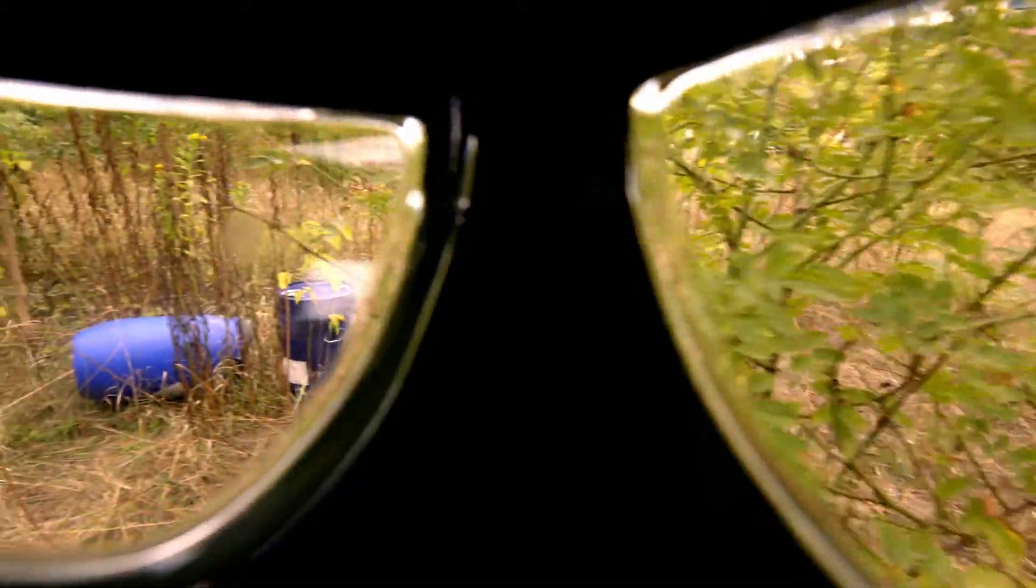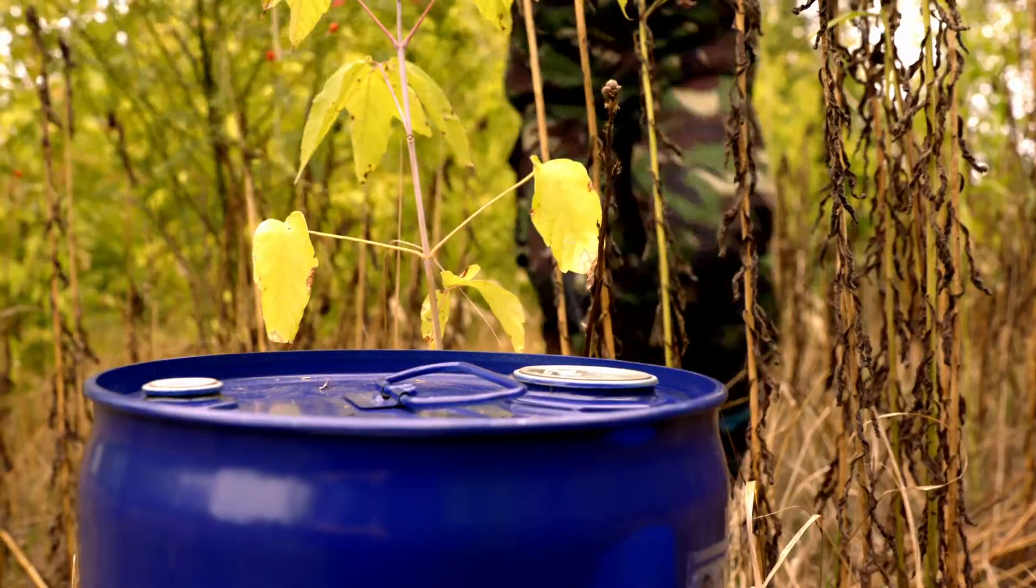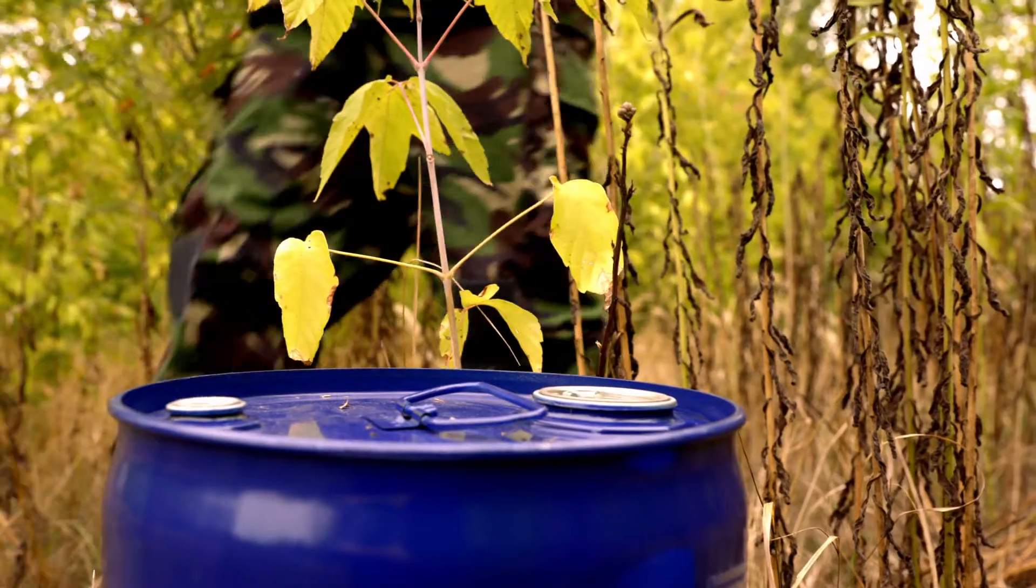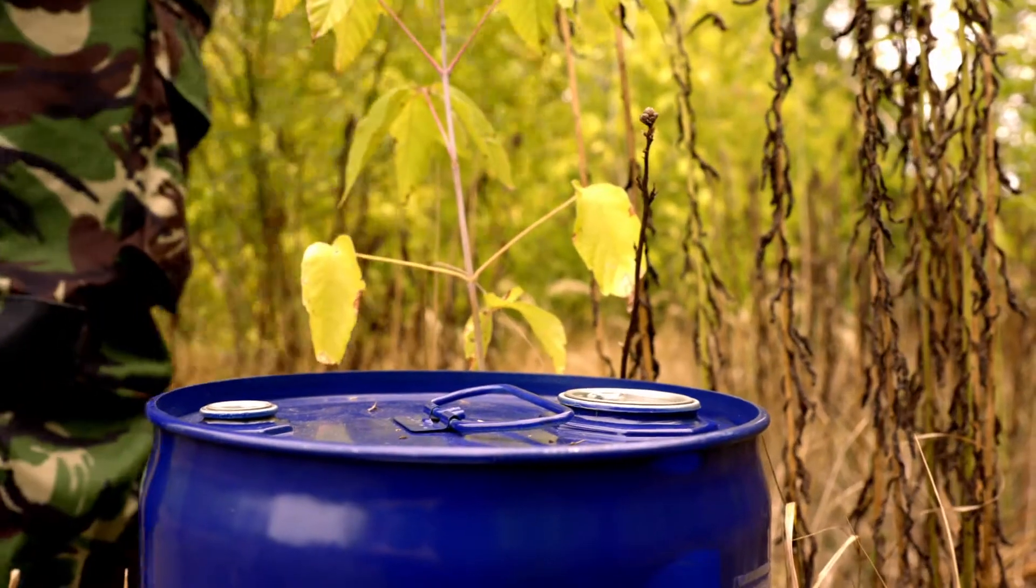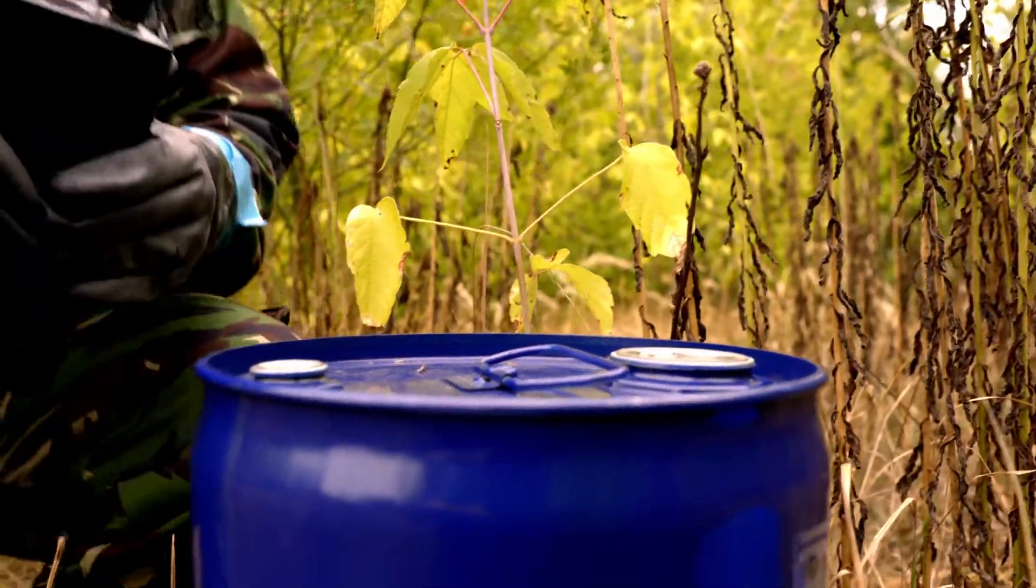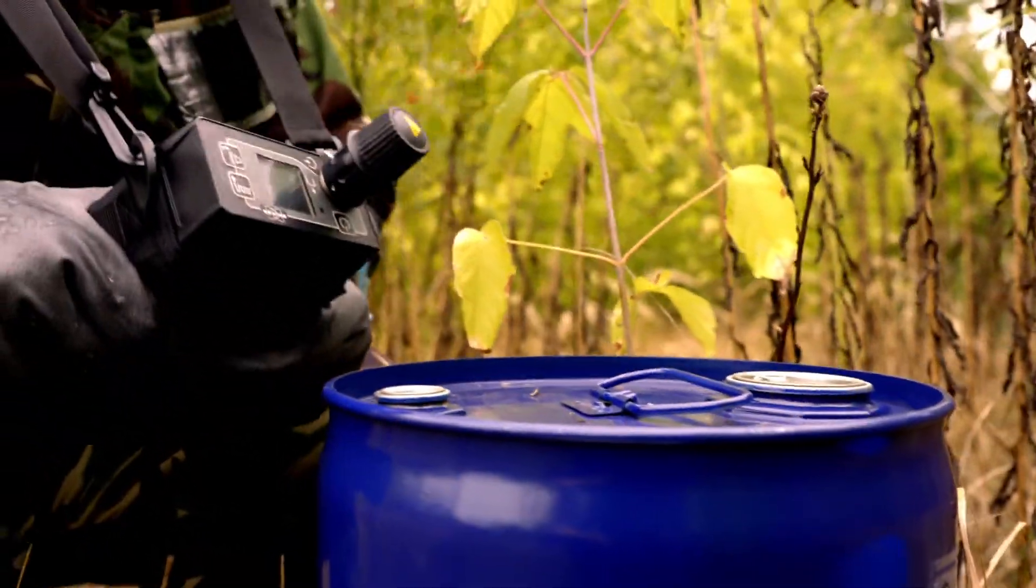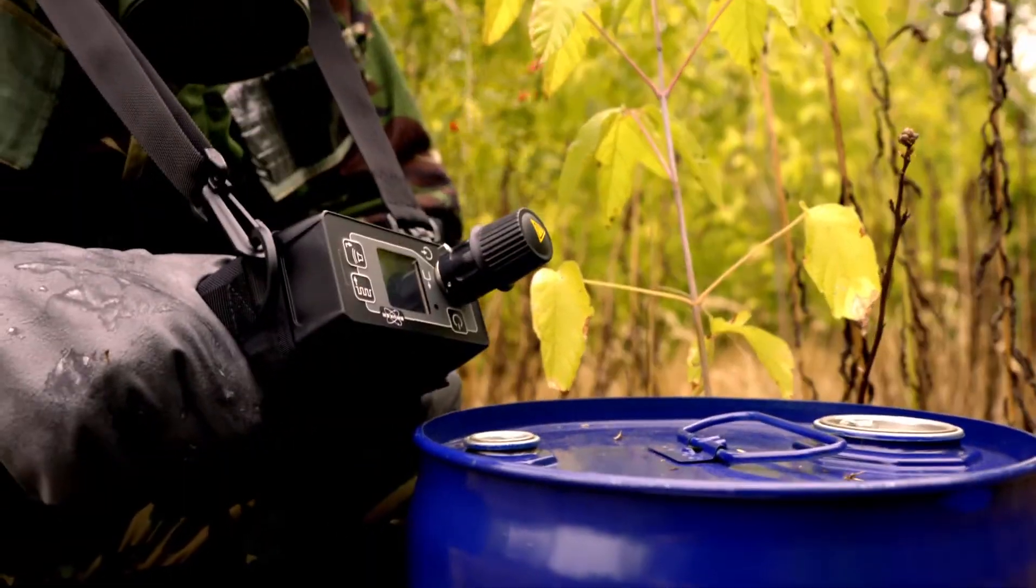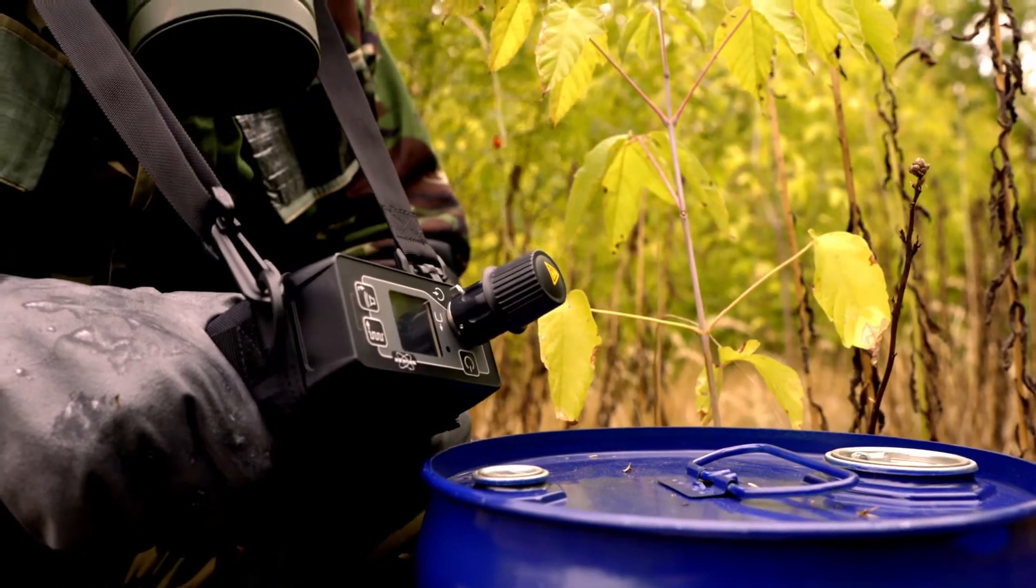MicroRAID Plus, Bruker's low-cost CWA TIC detector, is a go-anywhere device. Compact and lightweight, it is extremely easy to operate.